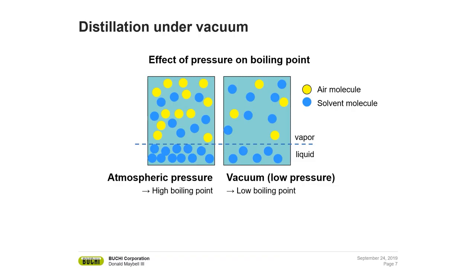And because we are working at a lower boiling point when we pull a vacuum, that means when we add extra energy to the system, because the liquid is more readily going from the liquid phase into the vapor phase, you can increase the throughput or the flow of particles from the liquid phase to the vapor phase. So by adding that extra energy and pulling the vacuum on the system, you can greatly optimize your process.